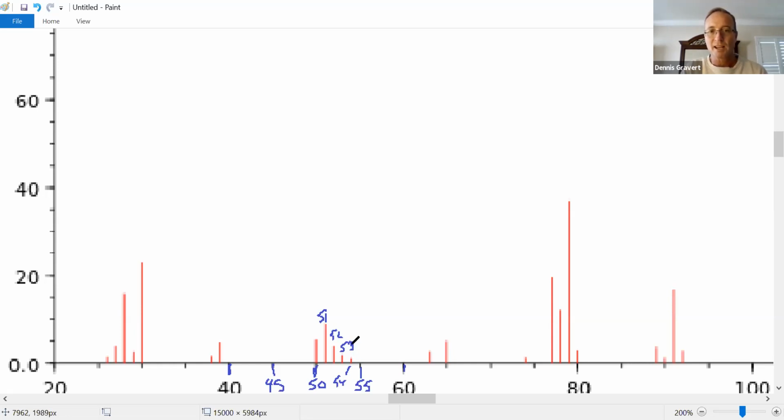And what are we doing? We're getting familiar, we're getting a little comfortable with the spacing. This distance is one mass unit. And we kind of confirmed that, right? So we found a peak here, here, here, here, and here. There's a tick mark. They're all evenly spaced. We're all one mass unit apart, and I proved it. 50, 51, 52, 53, 54, 55, proved it. So now I can just look at this and say, these are one mass unit apart. These are not, right? That makes more sense. That here is one mass unit, that there's one mass unit, because that's what this data told me.